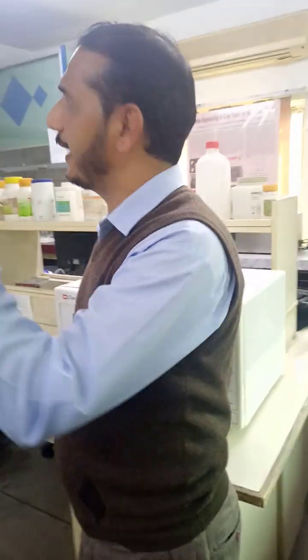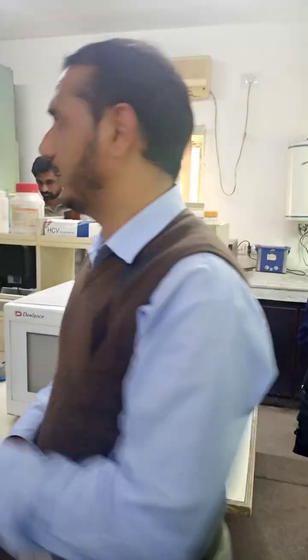The problem with PCR is that the technique is rather expensive. It doesn't change very quickly. Otherwise, we can also do the isolation and spreading of bacteria and DNA extraction. Yes, we have that sort of system in the lab.